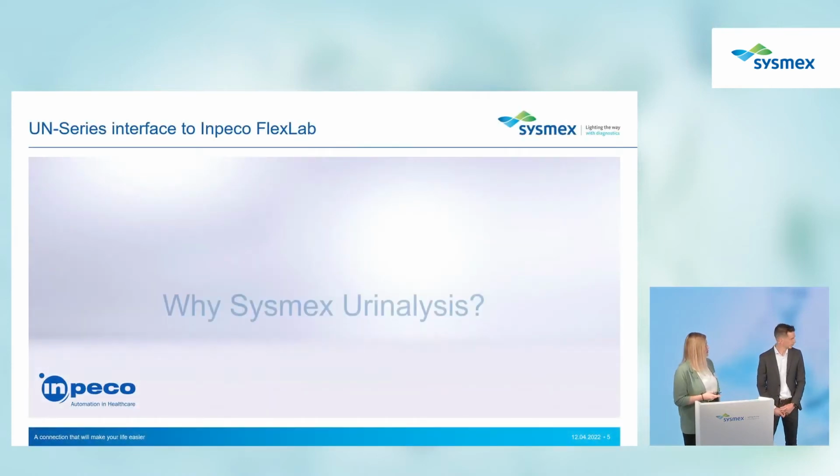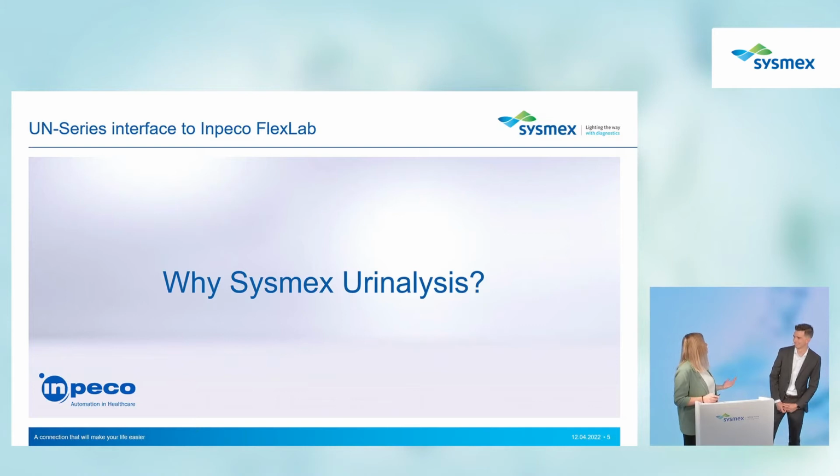Yes, to give you a few more informations, we're going to walk you through a few questions that we ask ourselves in the process of developing this interface. So the first one goes from me to you, Francesco. So why did you choose Sysmex urinalysis solution to connect to the Inpeco TLA track?